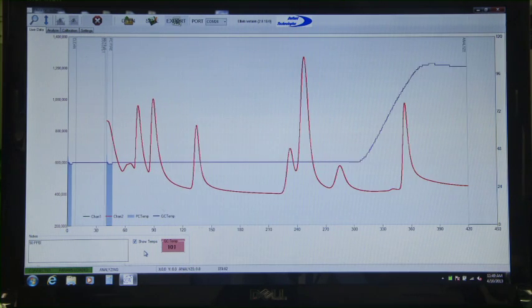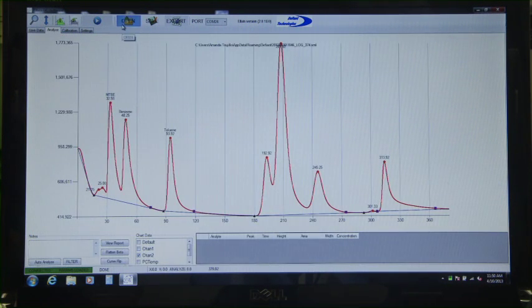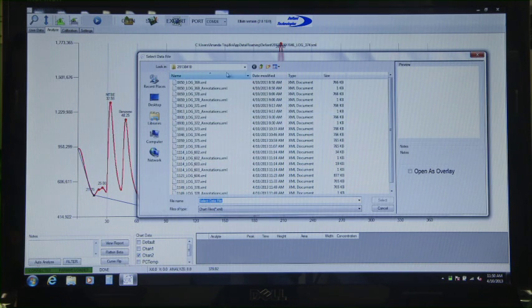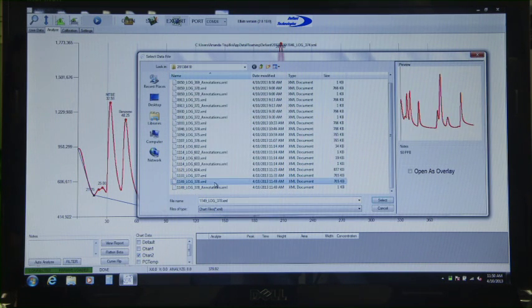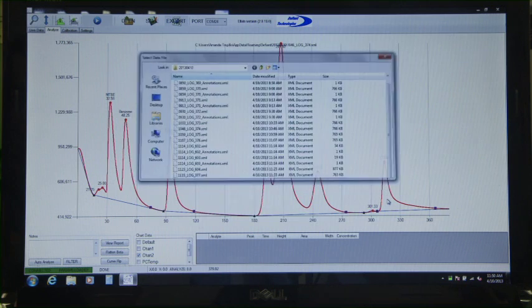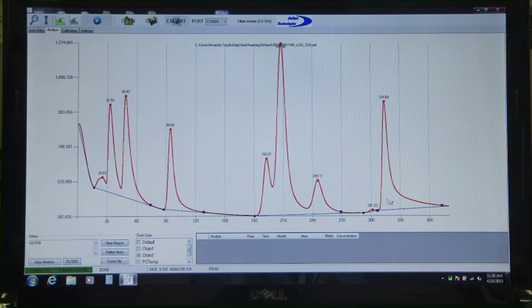At the end of a run, load the data file into the Analyze window. Click on the Open icon and choose the appropriate file. Click on Select and the file will open in the Analyze window.